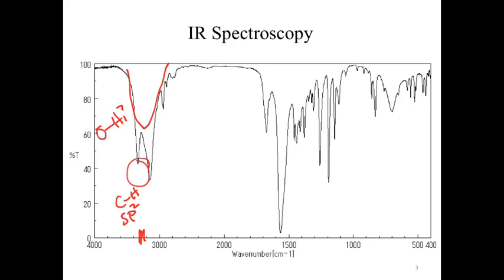It doesn't look like a standard CH-SP2, so I've got to admit I'm kind of confused as to what's going on out there, and that's fine. We just have to label it. I do also see some peaks in here, which if we roughly approximate, and I know my line is kind of awful, are just under 3,000. Probably looking at some CH-SP3s.